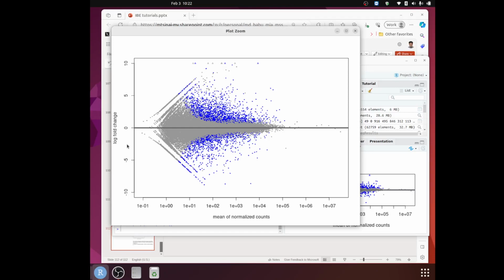the better differential expression they have. Either they are upregulated in here or they are downregulated in here. So this log two fold change from 0 to 10 and positive and 0 to negative indicates how differentially expressed, and in terms of log two fold change, how far these specific genes are.